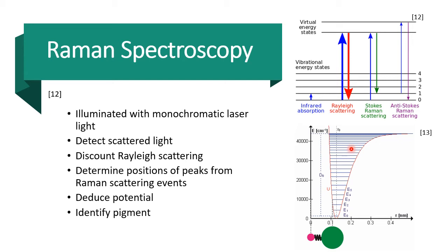It's relatively non-invasive compared to non-optical methods, as we know, but on the downside, because the proportion of photons that are actually scattered inelastically is very low, as low as 0.01% of all incident photons, the number of photons that have to be incident on the sample when taking the reading has to be higher than it would be when using other optical methods like reflectance spectroscopy. This means that the light intensity has to be high, or the exposure time has to be relatively long, or both.